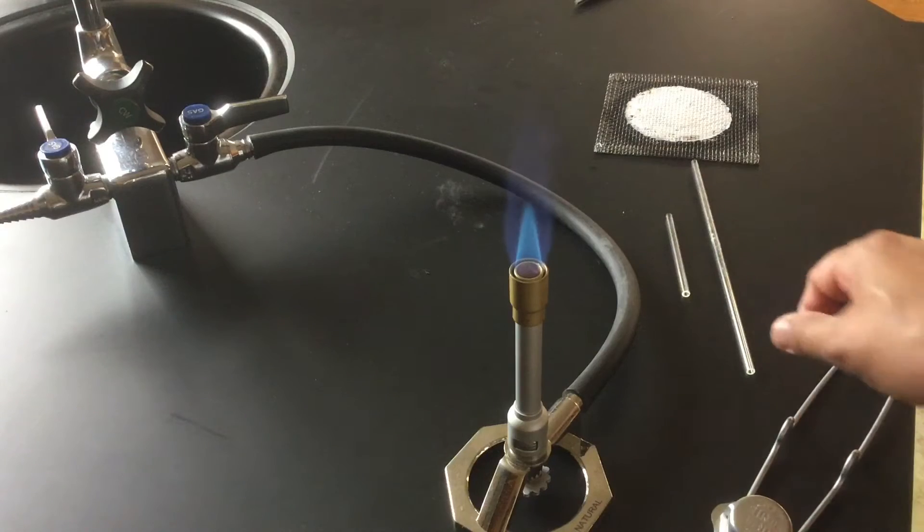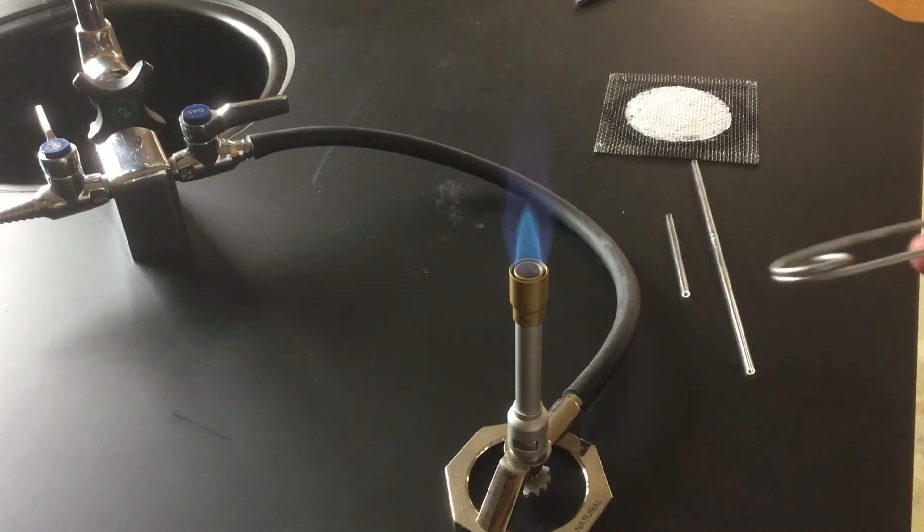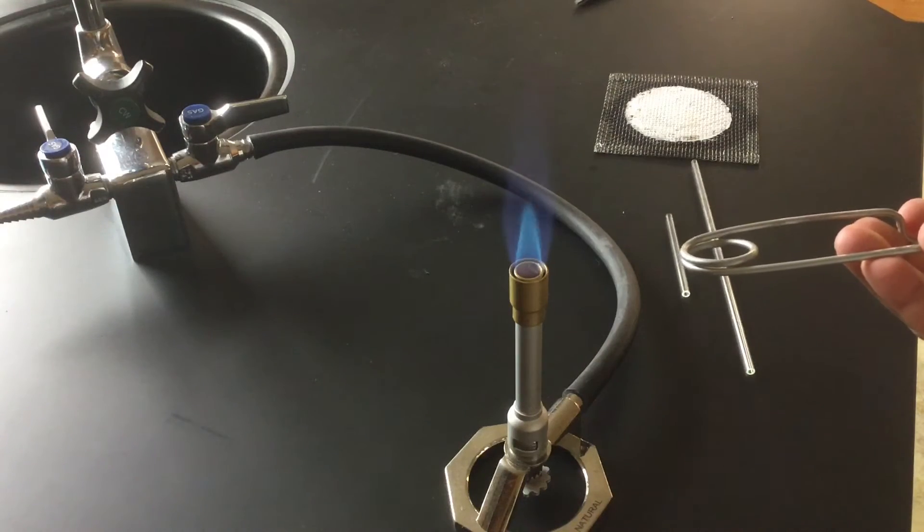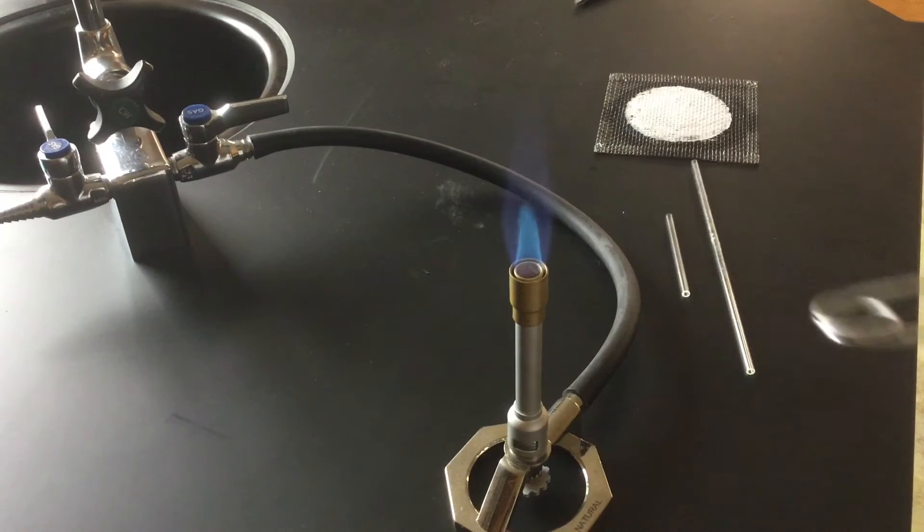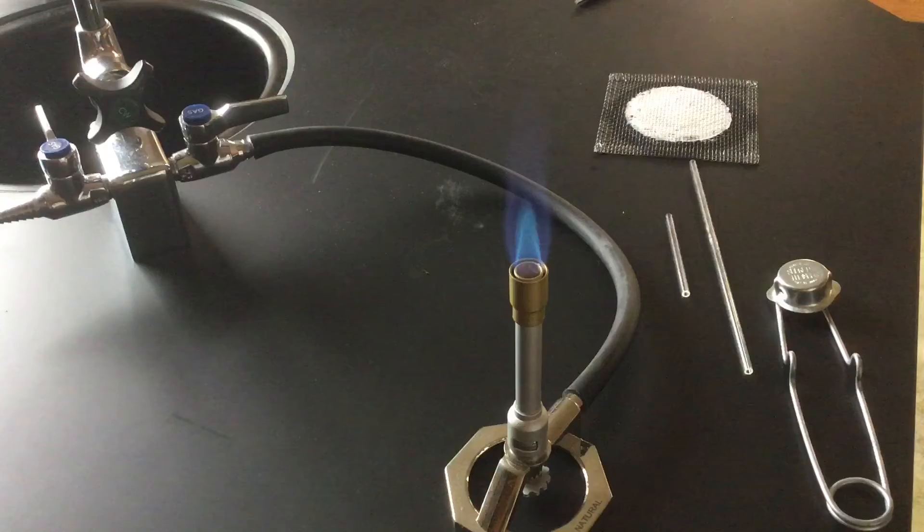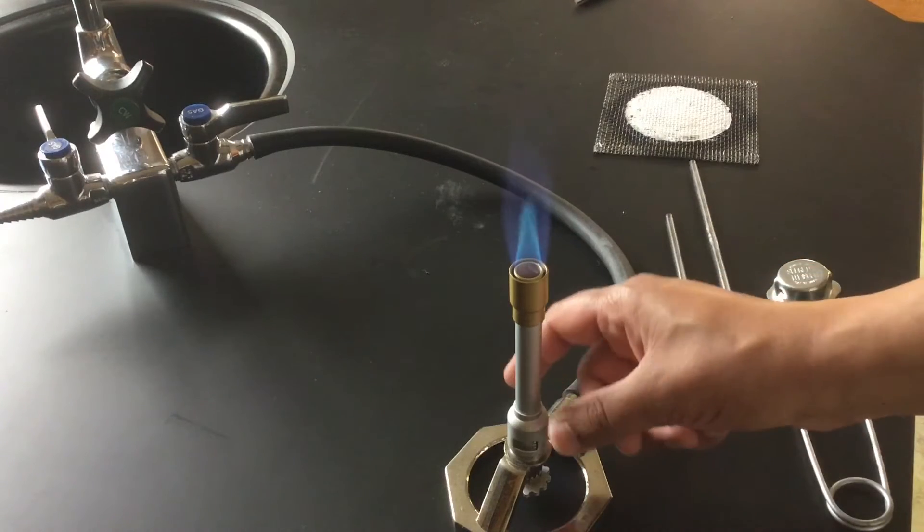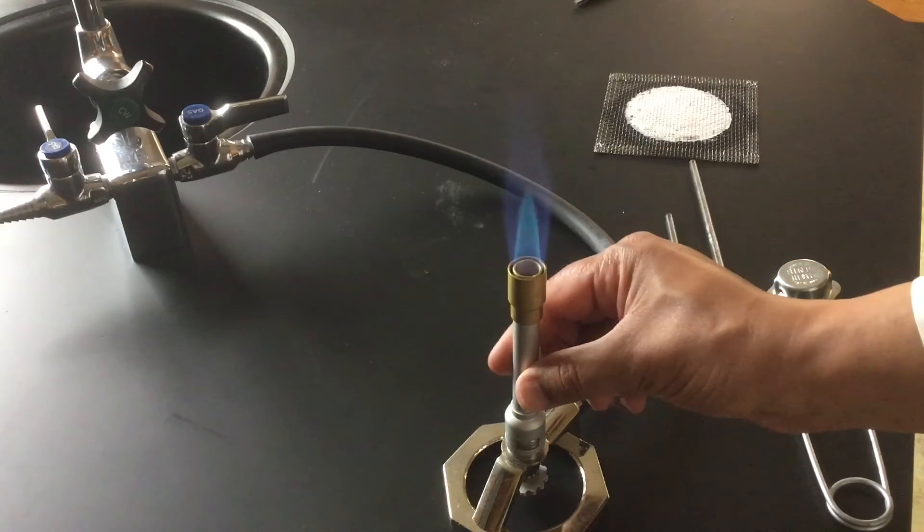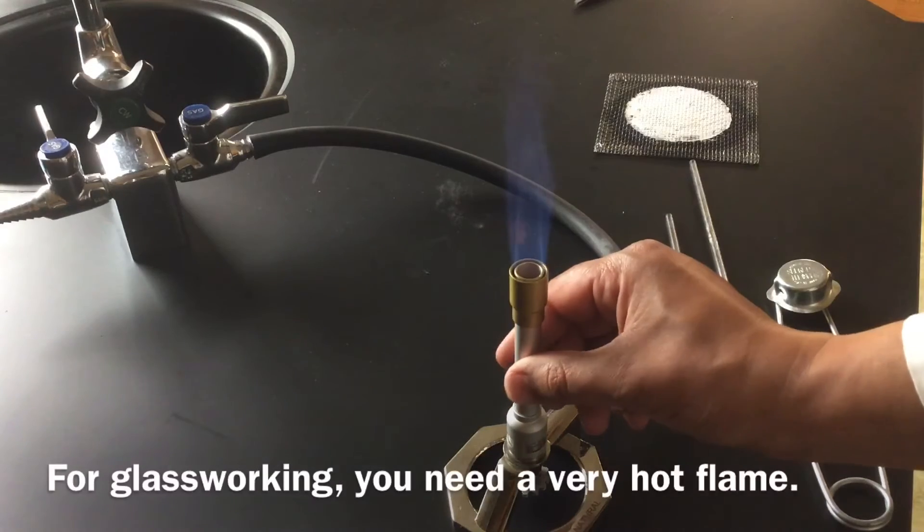As you can see here this is a very nice flame for this purpose because I have a pale outer blue cone that is kind of hard to see, but then there's that nice neon blue inner cone that's very hot. That's the part of the flame I'm going to use to fire polish this. So if it's not the right temperature you can adjust the temperature accordingly.